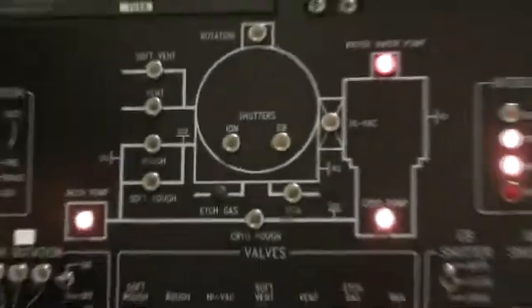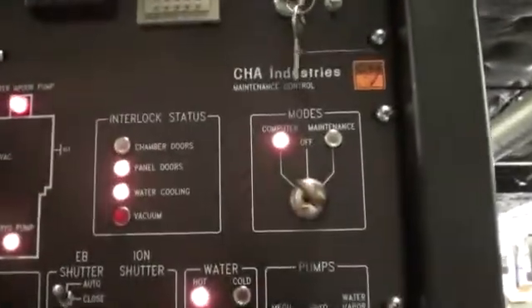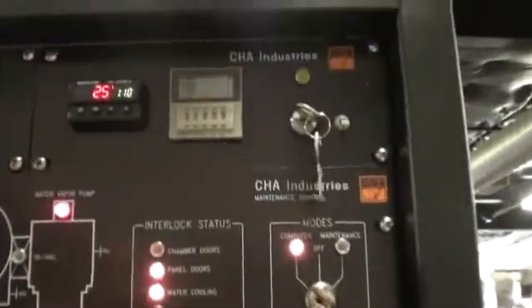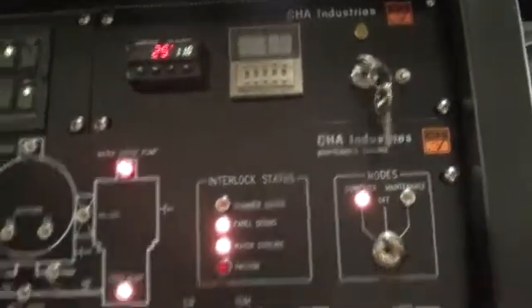This module right here is your heater controller. It's temperature and time. This panel right here is our maintenance control panel — valves, rotation, etc. — maintenance control as labeled. And just to recap, on the heater controls, we will be labeling that one before shipment.